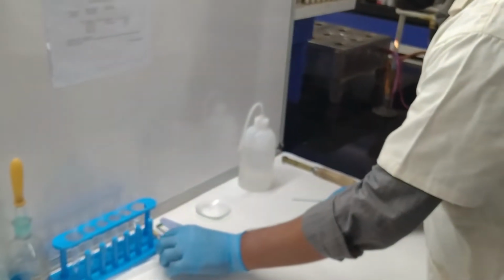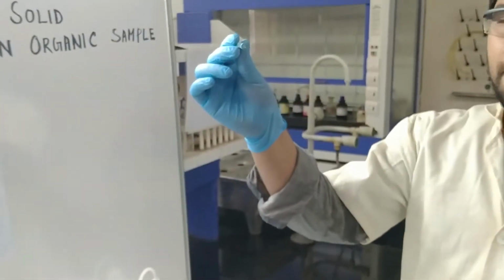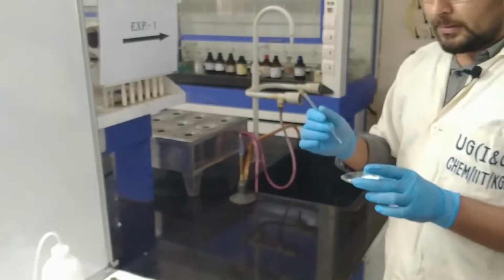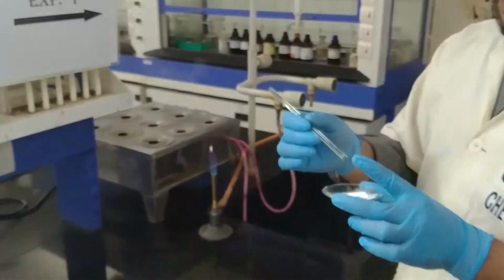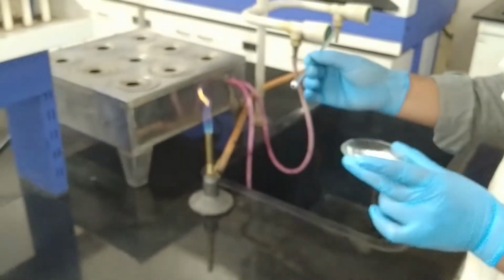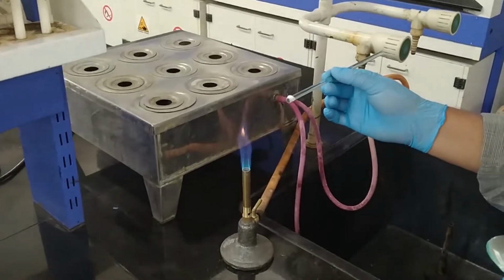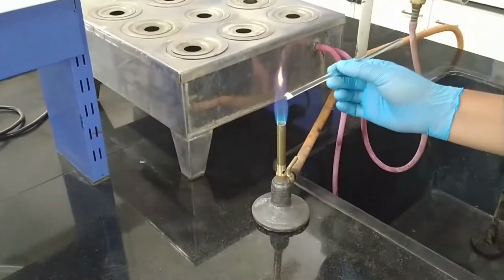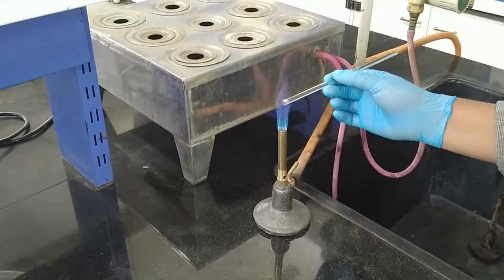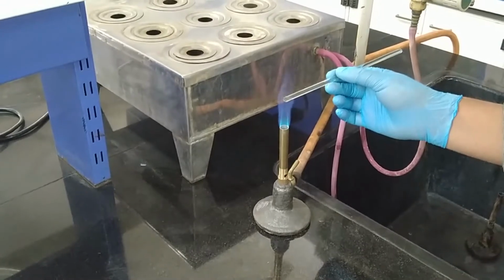We have to take a glass rod like this, and take some of the sample on the tip of the glass rod like this way, and put it in the flame. So in the ignition test, two observations you can find.